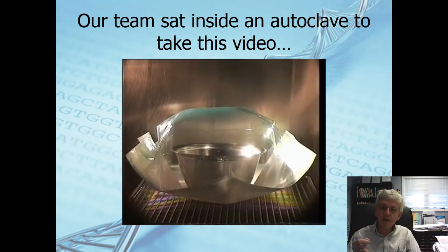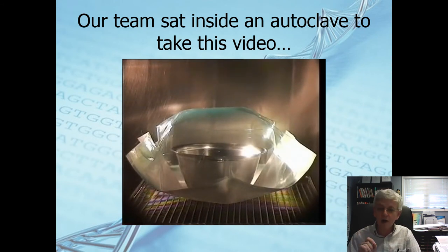Really right now it's just maintaining that pressure. This video would go on. This video, by the way, is about 11 minutes long. And I'm not going to show you all of this. It just cycles back and forth. But you'll get a really good idea of what this thing looks like. It's incredible as it goes back through these cycles.